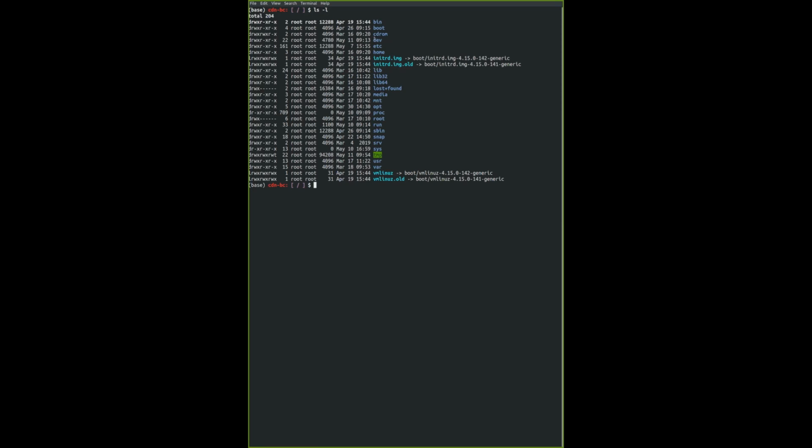I'm going to try to list out the files in dev. So this is a developer folder. A lot of developers play around with this particular directory to configure your boot up, or configure the preset settings for your computer. So I can type ls with a -l and then type dev, which is a folder within this directory.